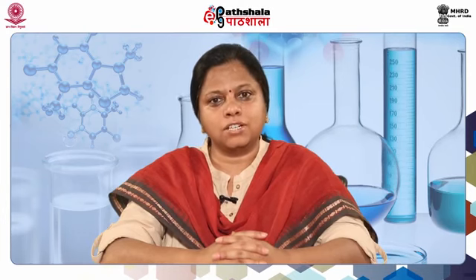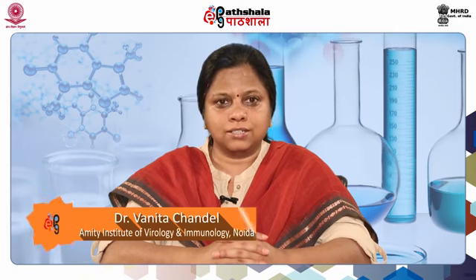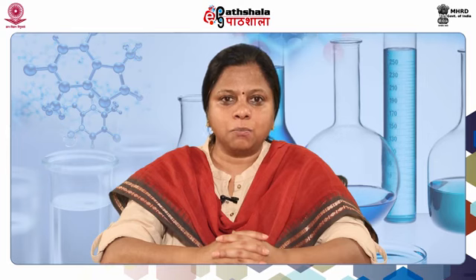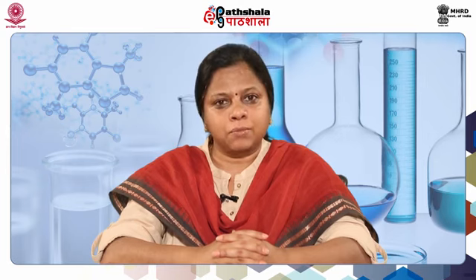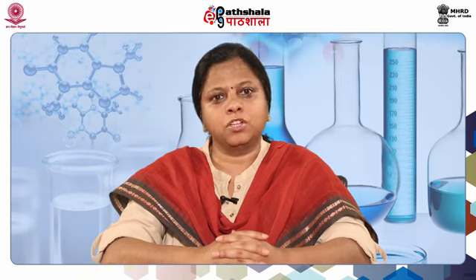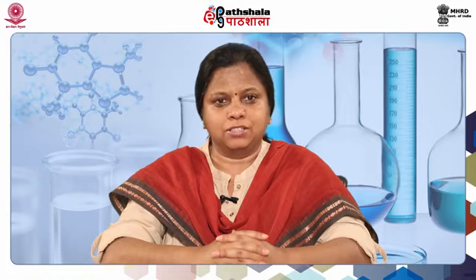Till now, you have learned about blotting, types of blotting, that is Southern, Northern and Western, principles of blotting and the detailed procedure of blotting, the membranes used in blotting, probes, their preparation and labeling of the probes. You also now know about slot blot hybridization.